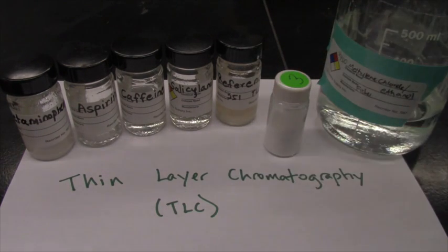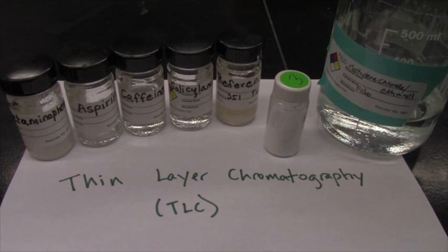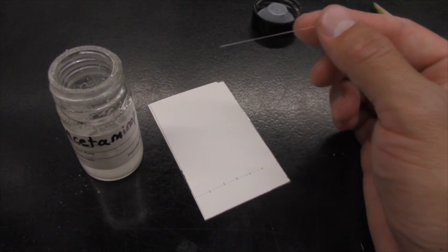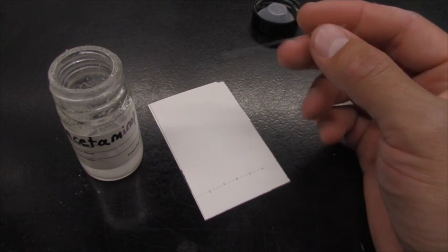Each group will have a different unknown. And you're going to dissolve 0.3 grams of that unknown into 5 milliliters of this dichloromethane ethanol mixture. And really, the goal of this lab is for you to determine which of these different drugs you have present in your unknown. So now I'm ready to go ahead and spot my compounds onto my TLC plate.